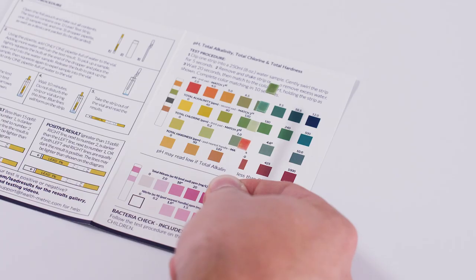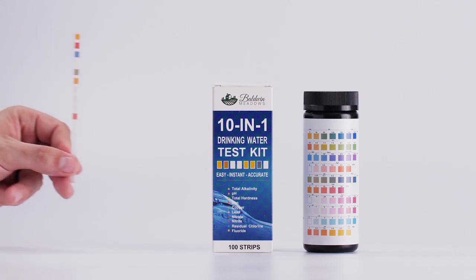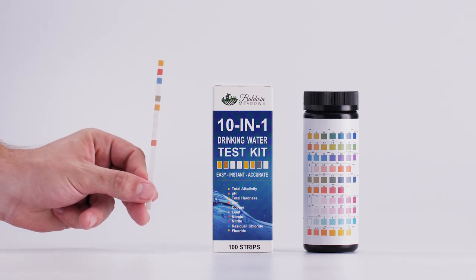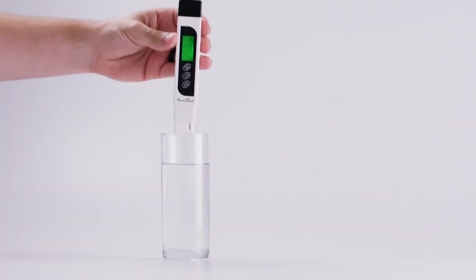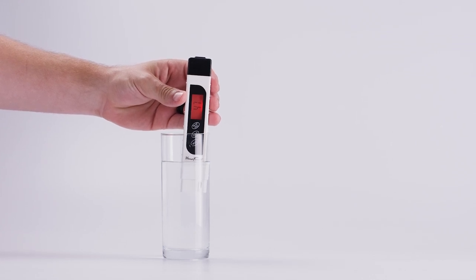It's really only necessary if you're worried about something in particular. For the most part you should be okay with the TDS meter and the basic strips. These products are really affordable and I recommend you try them for yourself. You might find out you're consuming things that aren't beneficial to your health and they could be hurting you in the long run.